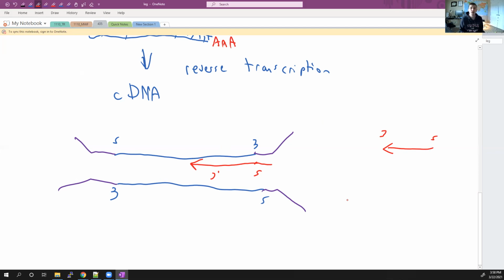The amazing thing with Illumina is that in the very beginning, when Illumina first came out, this is all they could do: just generate one read from double-stranded DNA. We call this single end reads. It's just one read per sequence.